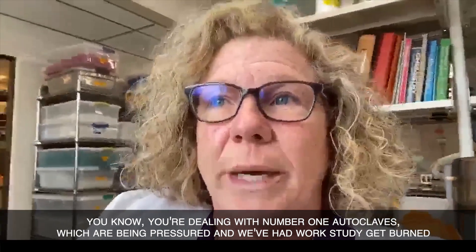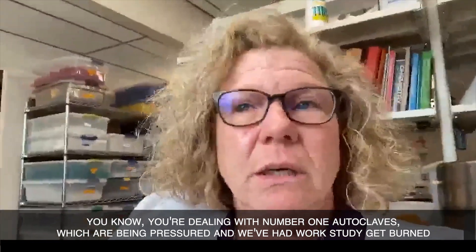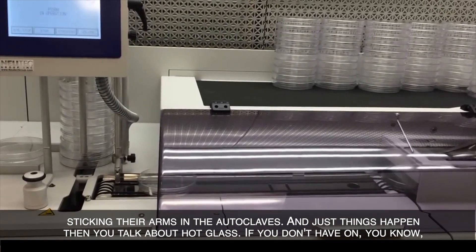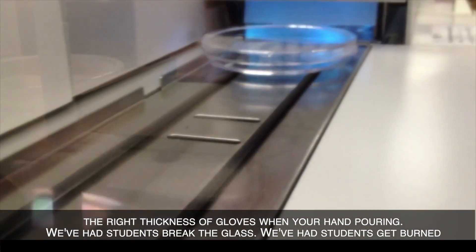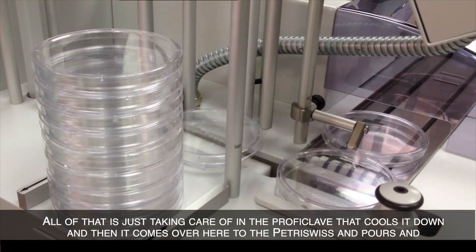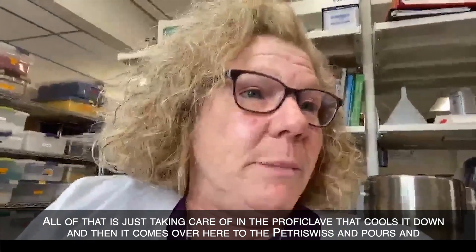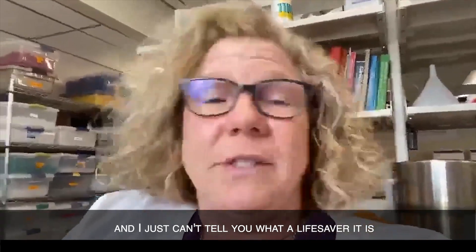Whenever you're hand-pouring plates, you're dealing with autoclaves, which are high-pressured. We've had work study get burned, students sticking their arms in the autoclaves. Then you've got hot glass — if you don't have the right thickness of gloves when hand-pouring, we've had students break the glass and get burned. All of that is just taken care of inside the Proficlave. It cools it down, and then it comes over to the Petri Swiss and pours. I just can't tell you what a lifesaver it is.